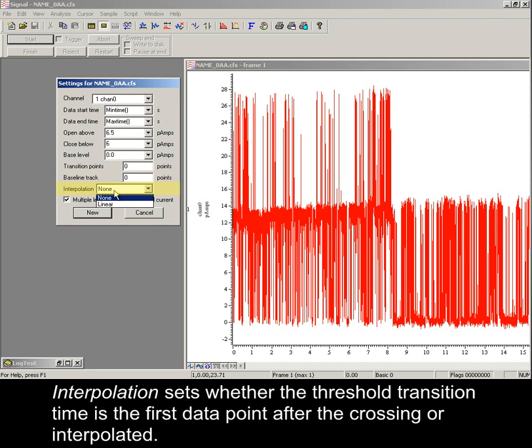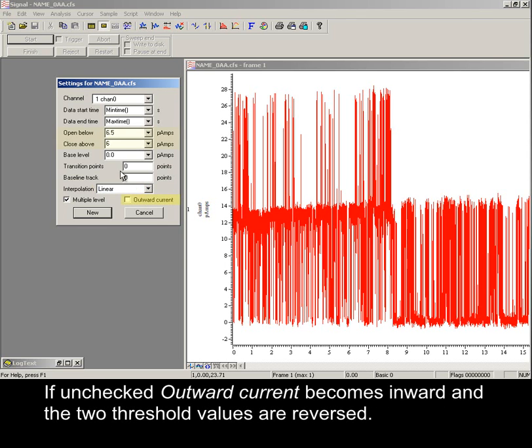Interpolation sets whether the threshold transition time is the first data point after the crossing, or interpolated. If unchecked, outward current becomes inward, and the two threshold values are reversed.